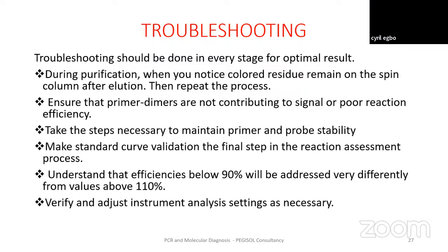Most times you find this NanoDrop machine in research laboratories. But PCR can do the same process, since there's a standard curve feature inputted in the PCR machine, which can do validation and determine the concentration of the DNA or RNA sample.